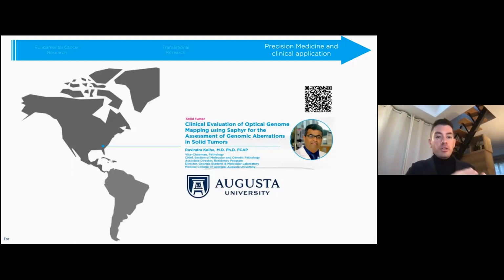So it's striking to see the discoveries made in cancer samples for which the standard of care is already focusing on the identification of structural variants. And that really highlights the importance of applying optical mapping in solid tumors, cancer types where classical cytogenetics is not applied as it is in leukemia, and where structural variations tend to be largely overlooked.